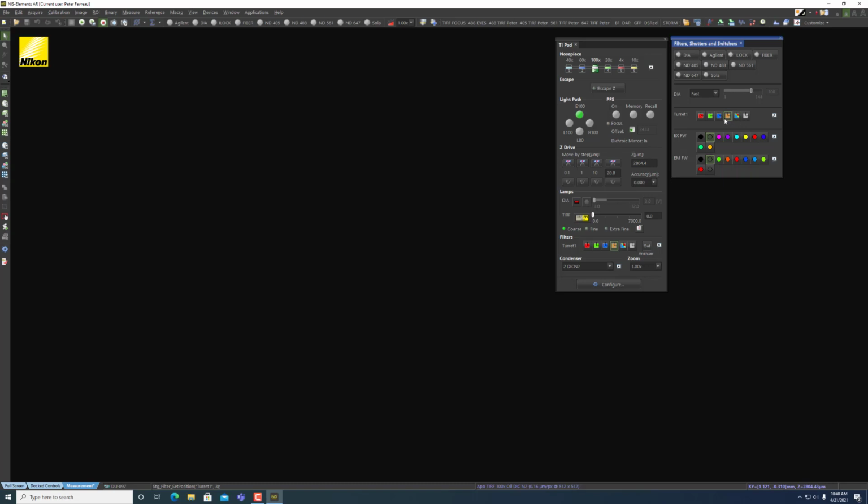To explain that, let's talk about GFP. If you wanted to, you could just click this button, and these both need to be empty, so no other filters need to be in place. So you could do this for just GFP by itself. That is totally fine. But if I wanted to better approximate GFP potentially, or I wanted to use these filters instead, what I could do is hit this quad button.